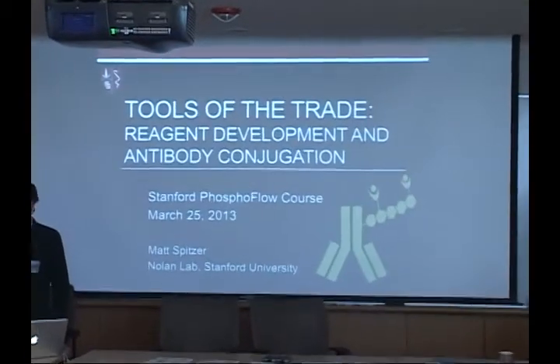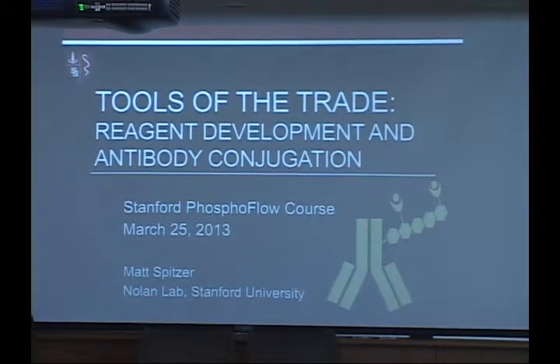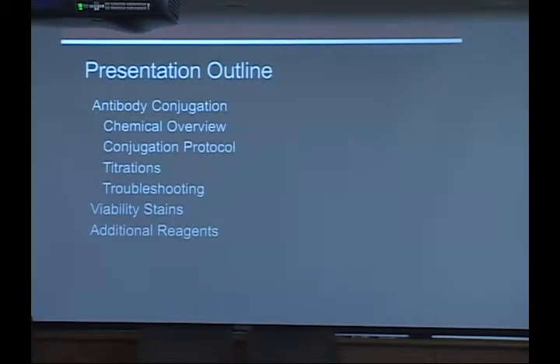It's kind of the bread and butter of making sure that you have the tools that you need to ask the biological questions that you're interested in. So first, I'll go through kind of the overview of how we conjugate antibodies and how we assess their validity.